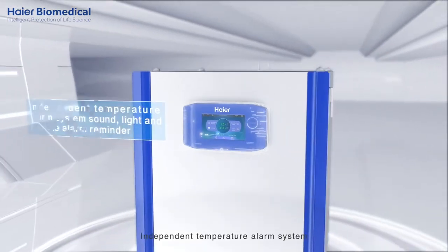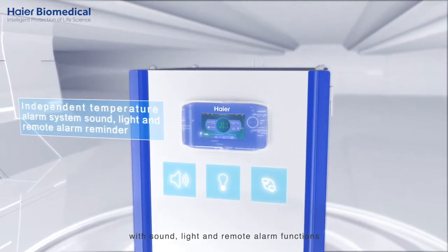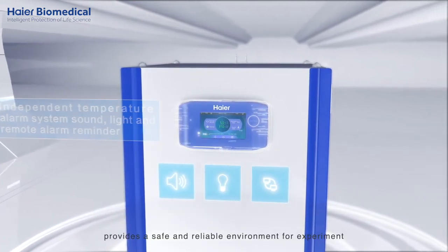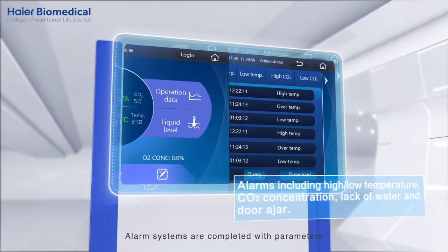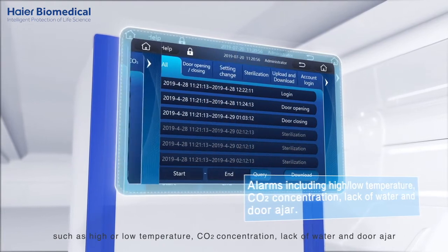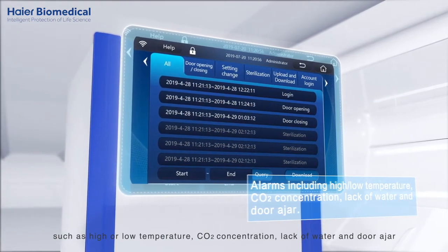An independent temperature alarm system with sound, light, and remote alarm functions provides a safe and reliable environment for experiments. Alarm parameters include high or low temperature, CO2 concentration, lack of water, and door ajar.